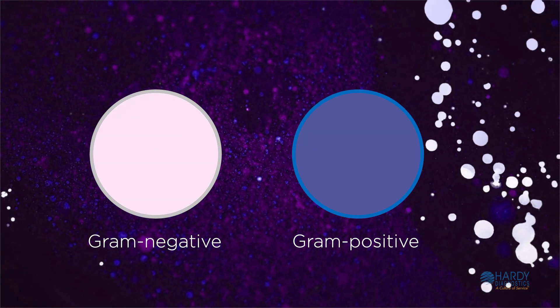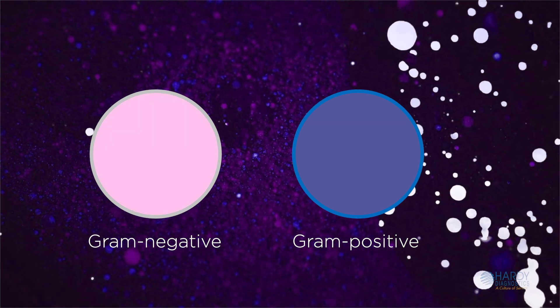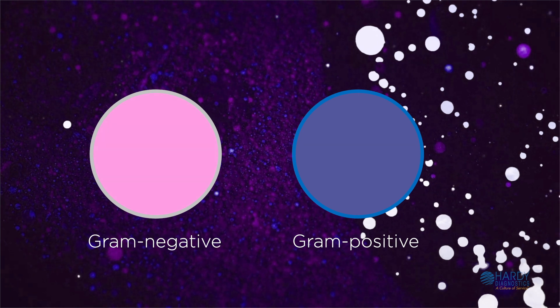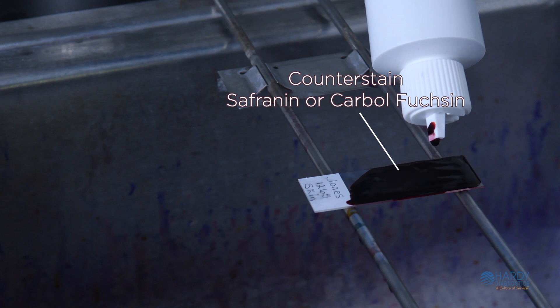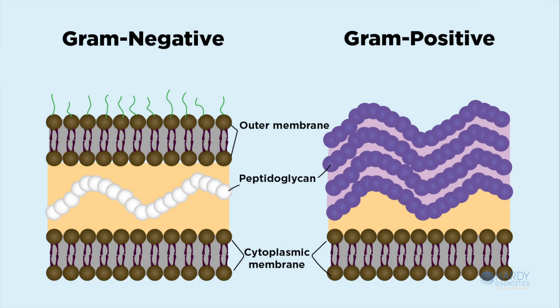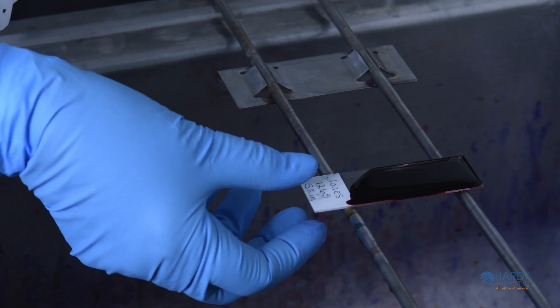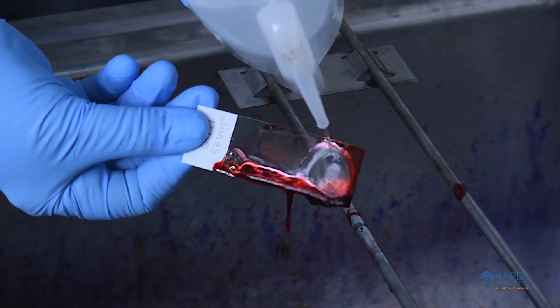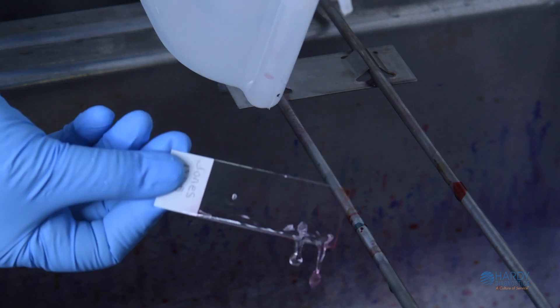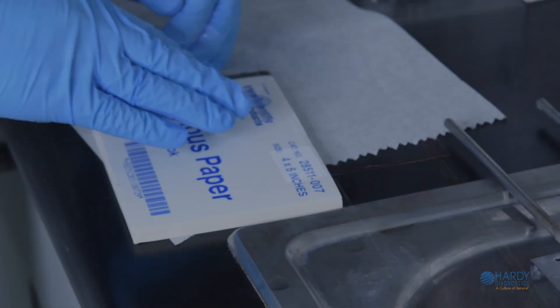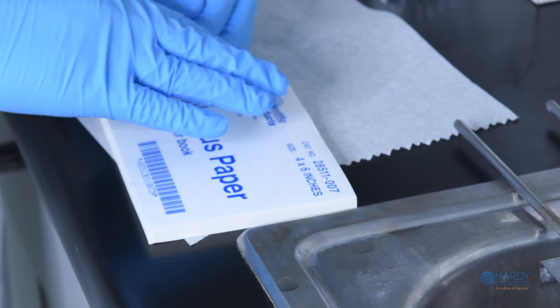The final step utilizes a counterstain of a different color to differentiate gram-negative from gram-positive cells. Cover the slide with safranin or carbolfuchsin for one minute. The gram-negative bacteria will absorb this dye, causing them to stain pink to red. There will be no effect on gram-positive cells since they retain the initial crystal violet stain. Rinse the slide with deionized or tap water. Do not wash the slide excessively. Allow the slide to air dry by tilting it onto a paper towel or over a sink.